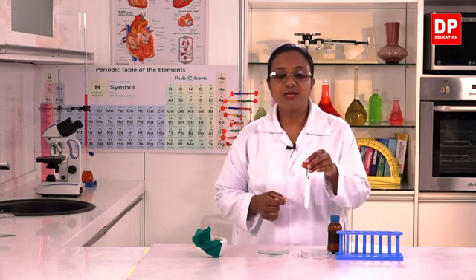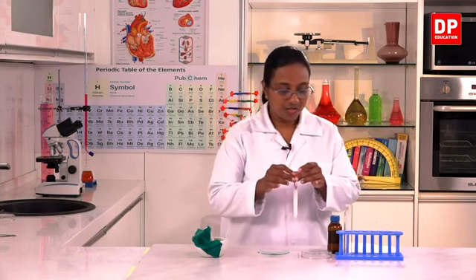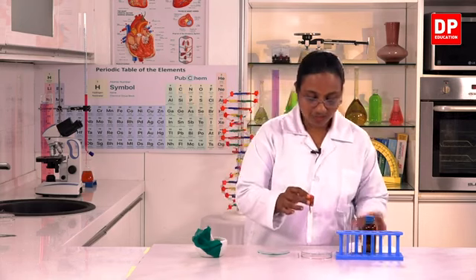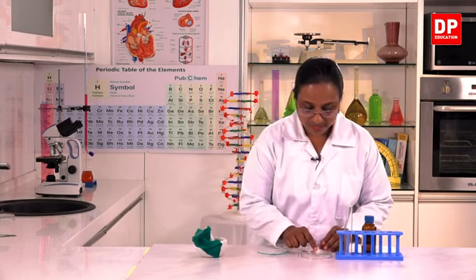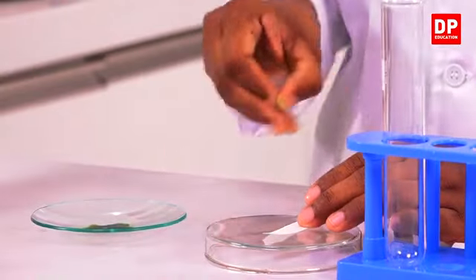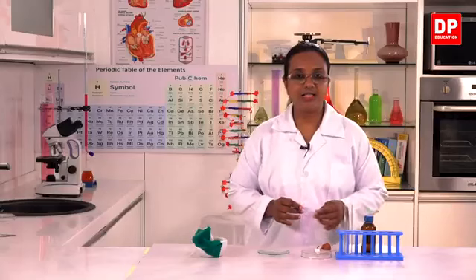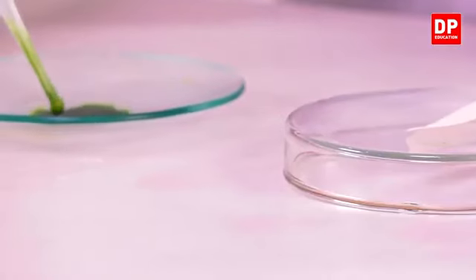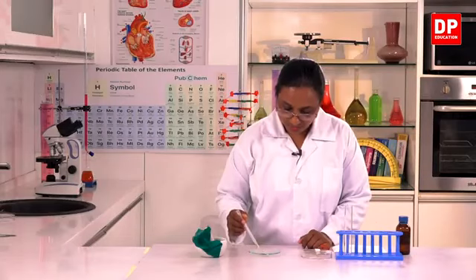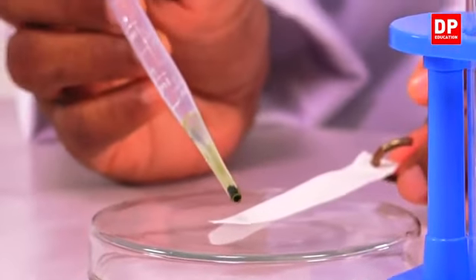So on this, first I have to make a spot of the sample. To do that, I have a petri dish here. I'll place the chromatography paper on this. To make the spot, normally we use a capillary tube. Here I'm going to use a very thin drop using the pipette. So I'll try to make a very tiny drop using this.